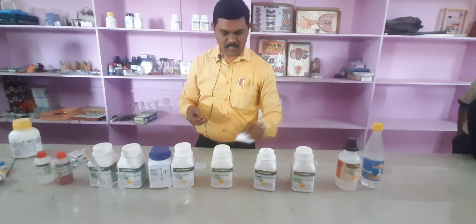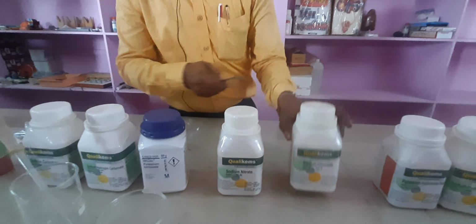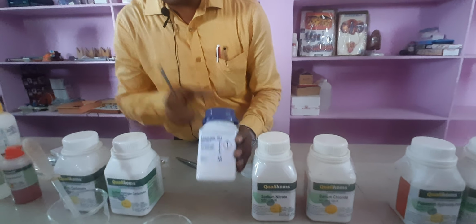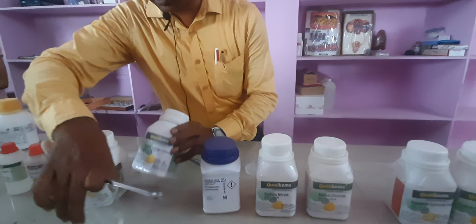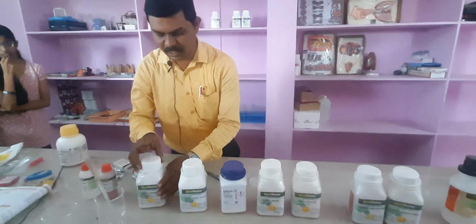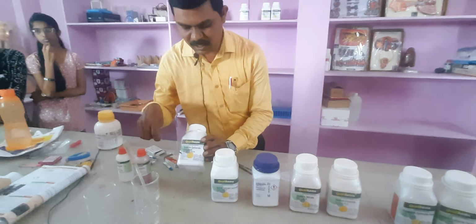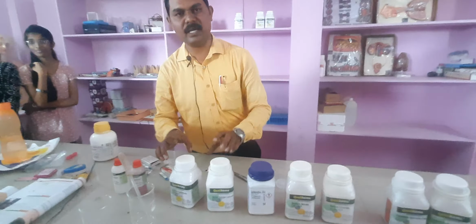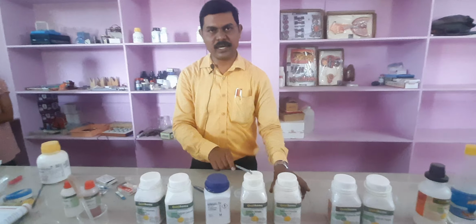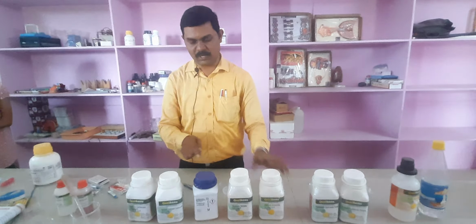Remaining all are salts. These are all the salts that you are observing here. This is barium chloride, one salt, and sodium nitrate is another salt, and this is potassium nitrate, KNO3 is the formula. Potassium carbonate. Sodium hydrogen carbonate, NaHCO3, is one other salt, and here sodium carbonate, Na2CO3 formula, Na2CO3.10H2O, so hydrated and anhydrous. This is anhydrous sodium carbonate. All the chlorides, carbonates, nitrates, sulfates, bicarbonates, meaning sodium hydrogen carbonate, are all salts.